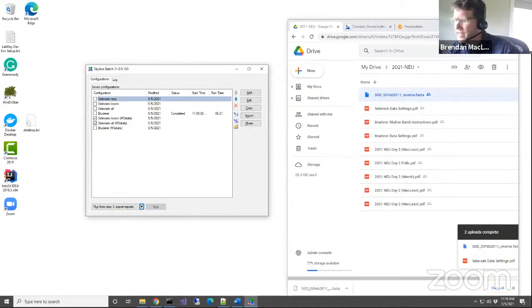And let's go with, I guess, back to the bottom. These course tutorials and sessions have been great, and I follow along no problem, but I'm a bit confused about the big picture of what Skyline does. What process steps must be followed, such that I get confused when I process my own projects? I think it's because I don't fully understand the rationales behind the steps. I've tried some of the website tutorials and some improved my understanding. Is there a manuscript or webinar or document you suggest for understanding the workflow in general and its rationale?